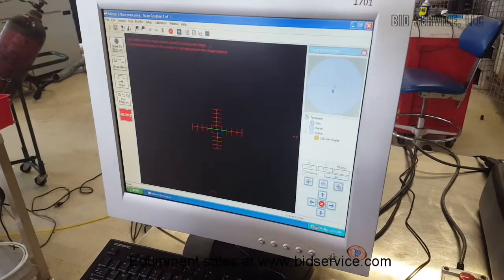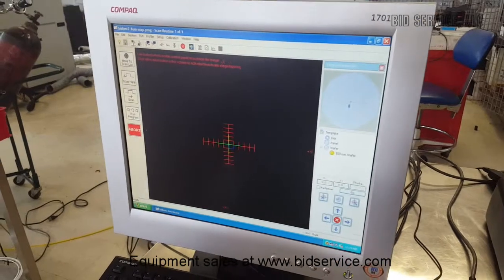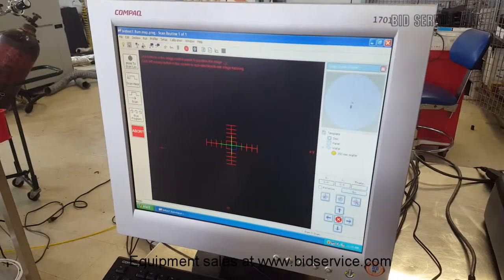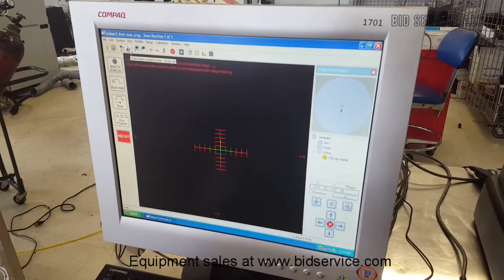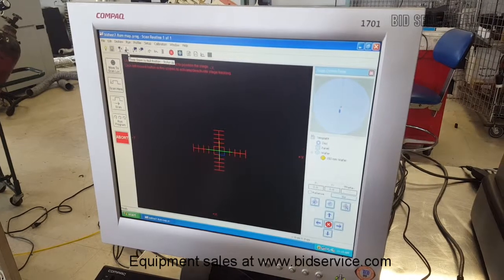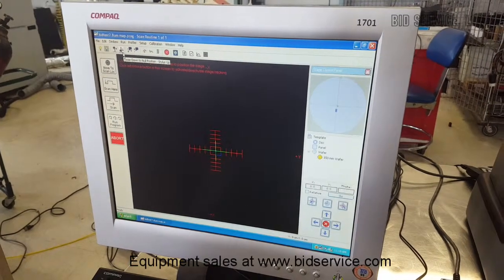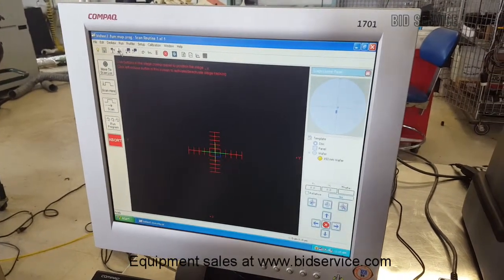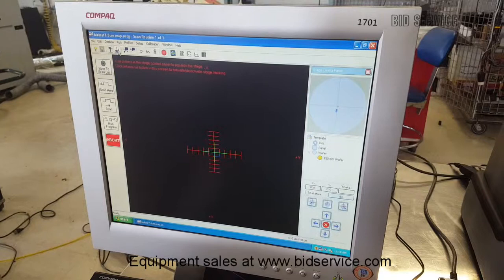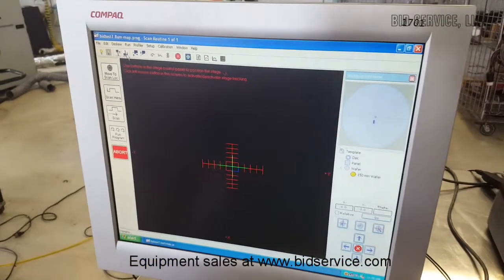So once the system is initialized, it's basically ready to use. You place your sample on the stage underneath the stylus. And then you can come here and do a touchdown.